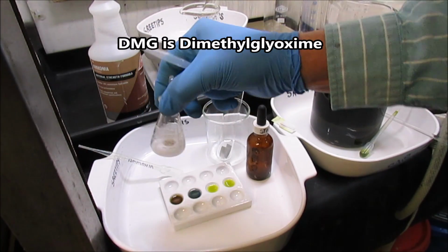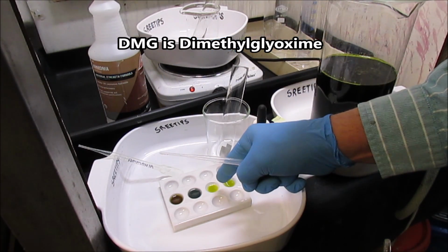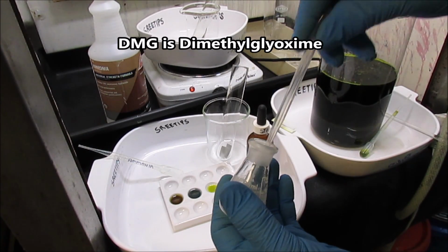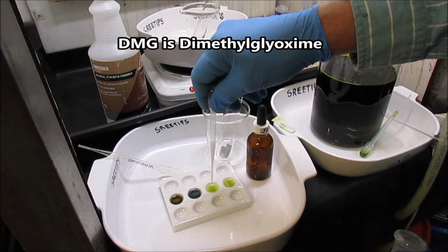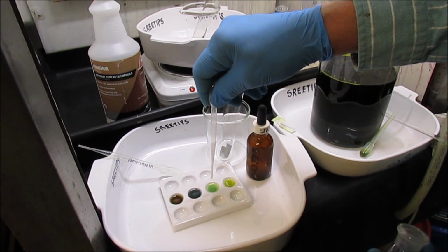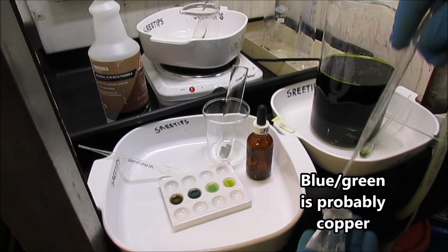Here I've got a little bit of DMG. And what I'm going to do is add some DMG to this cavity. And I get a little bit of a bluish green precipitate there. I'm not quite sure what that is.